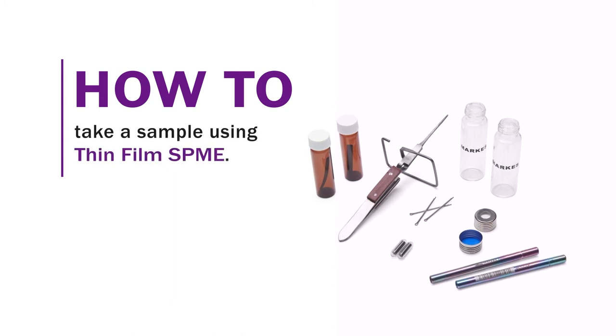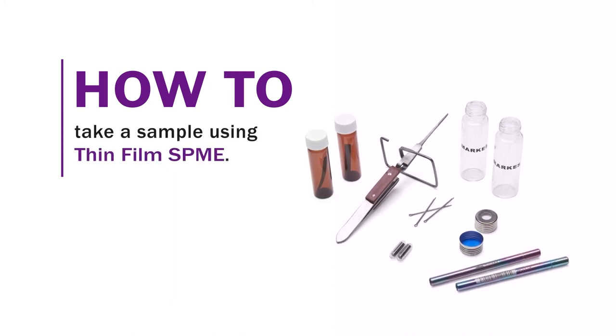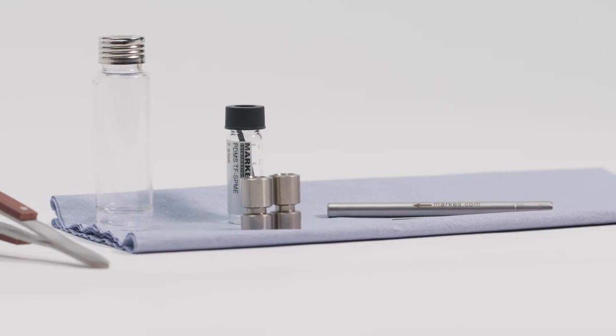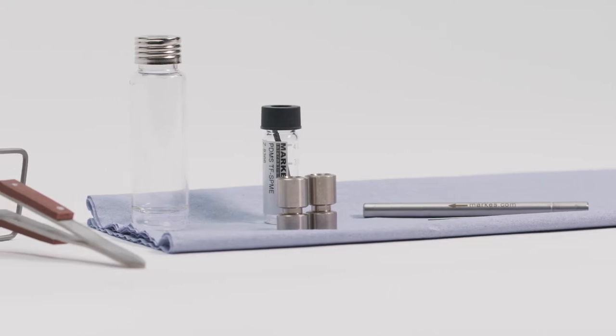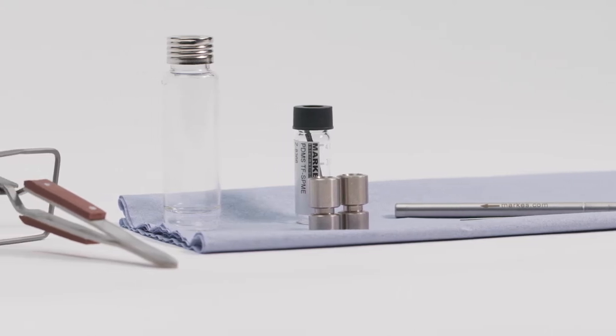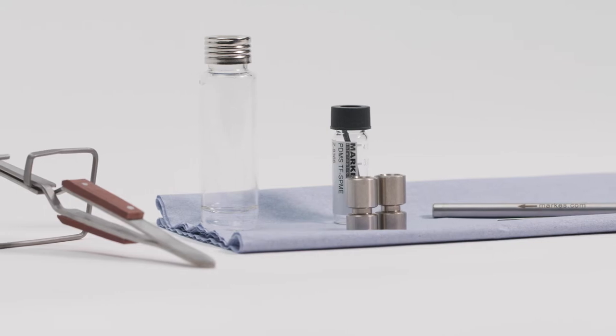The following video will show you how to take a sample using ThinFilm SPEEME. You will need a ThinFilm SPEEME kit and a pair of tweezers to hold the membrane and insert it into the carrier tube.